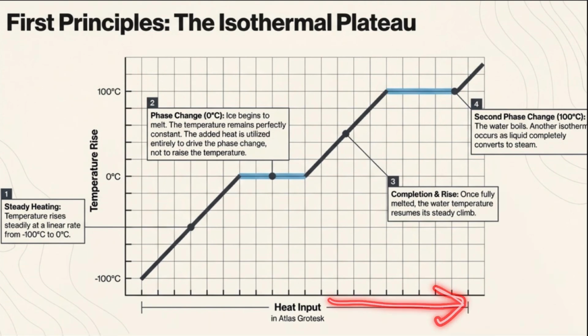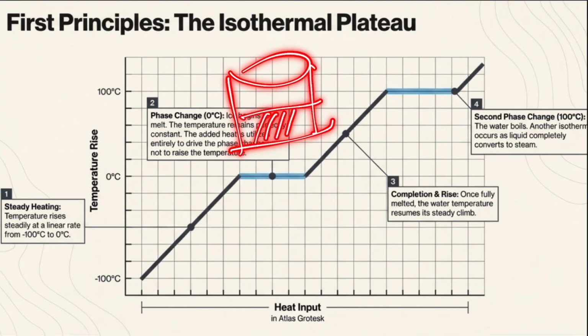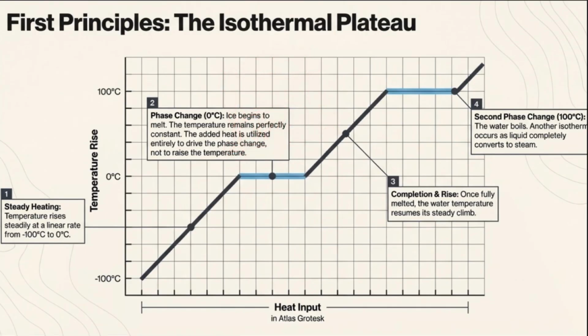After reaching this point, we are again supplying the heat from the furnace, but the temperature of this container is now not further increasing and it remains constant. Why? At 100 centigrade the water starts to convert into steam or vapors, and the temperature will remain constant until the whole water has been converted into vapors and steam. Once the water boils, the temperature then increases further.